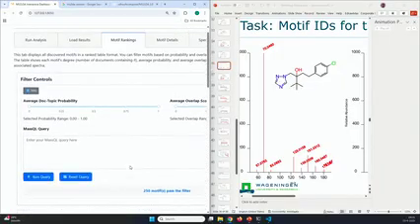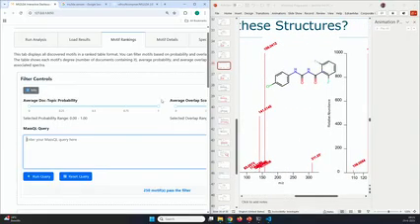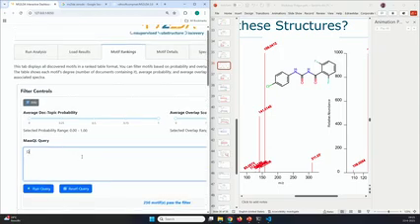I will show you something about that later, but let's go to the next one. This one is the benzoyl-urea structure, and here we do exactly the same. We try to find it by scanning. It's always switching between German and English keyboards. And here, I think there are two really dominant fragments. One is 141 and one is 158. So we can try that out, one the query.